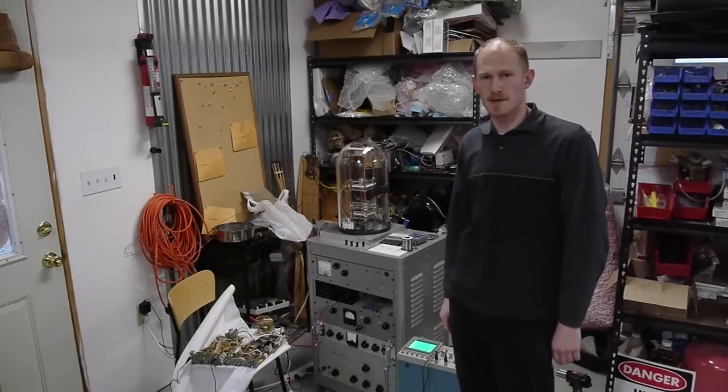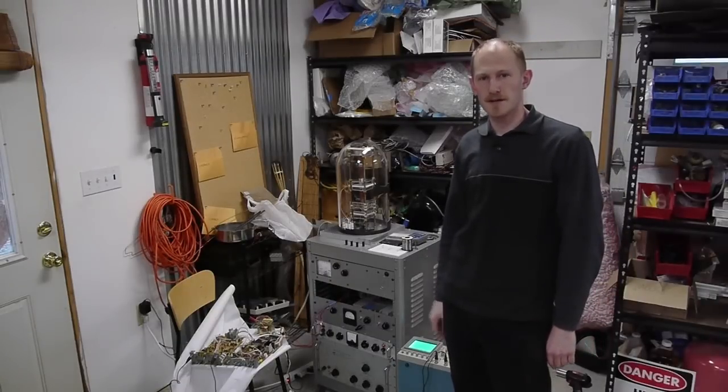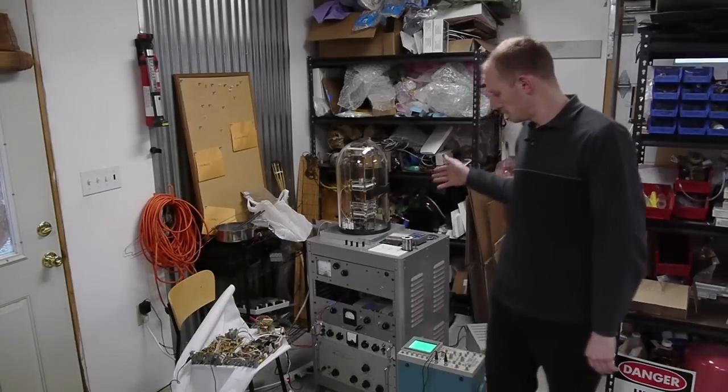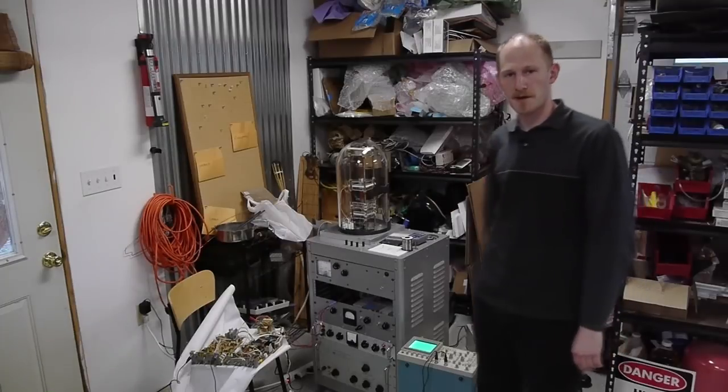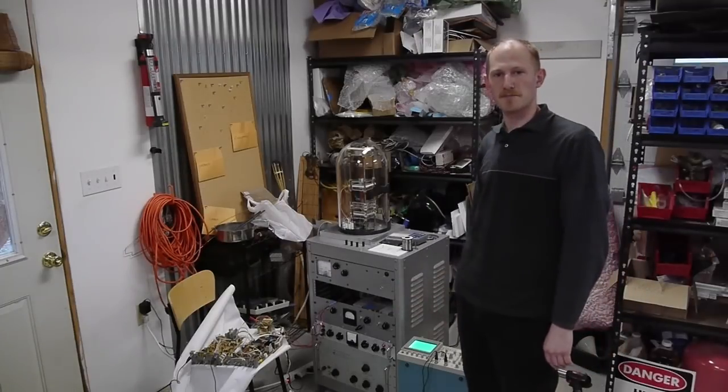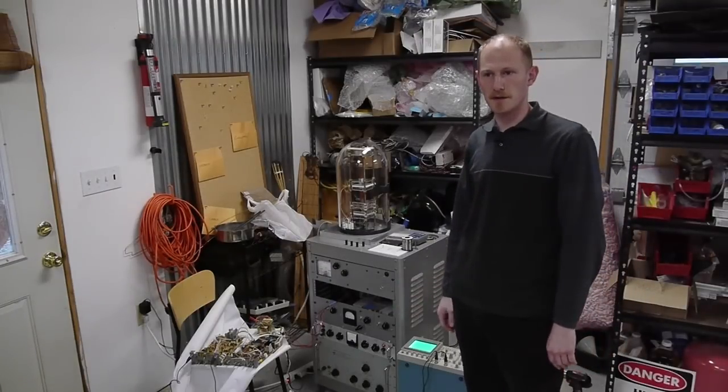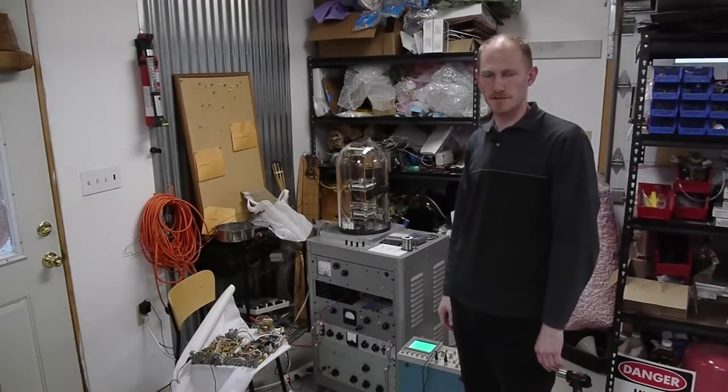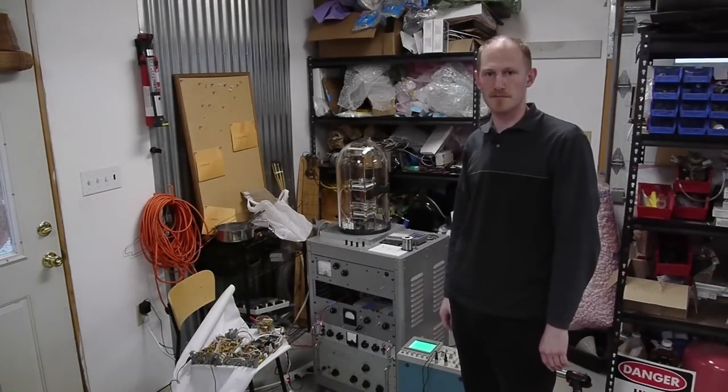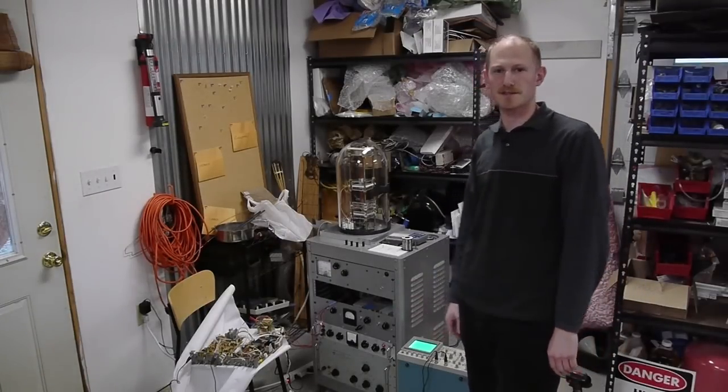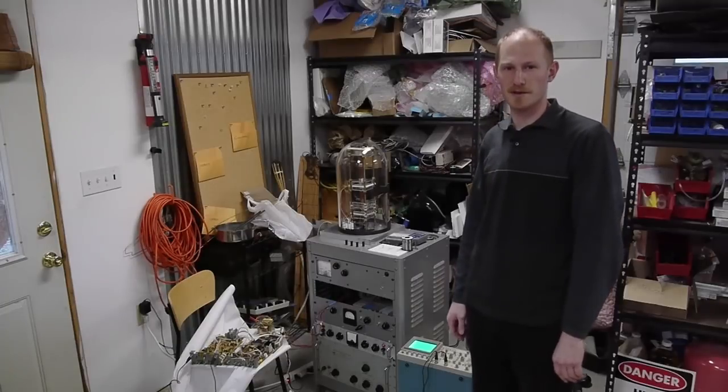Hey guys, Ben here. I'm with the DIY Scanning Electron Microscope project, and this video will be my official entry for the MyTektronix Oscilloscope contest.